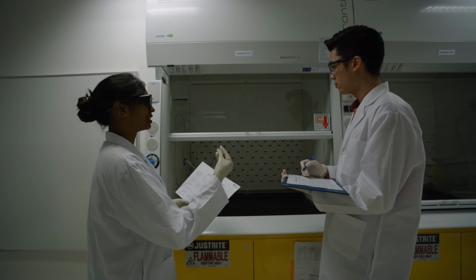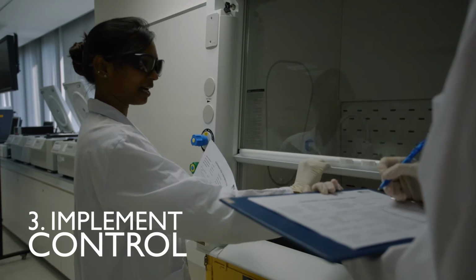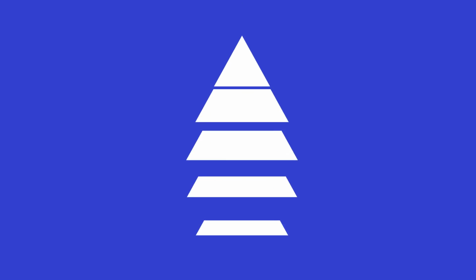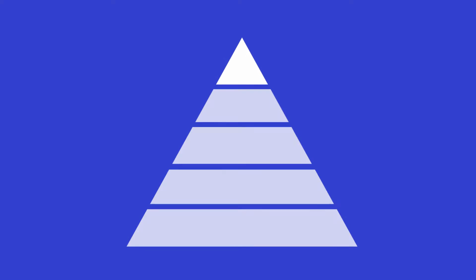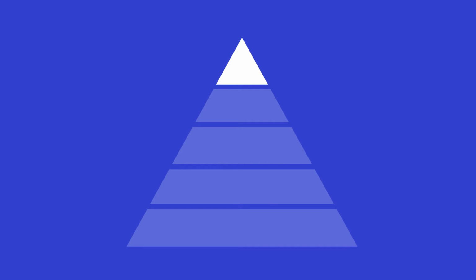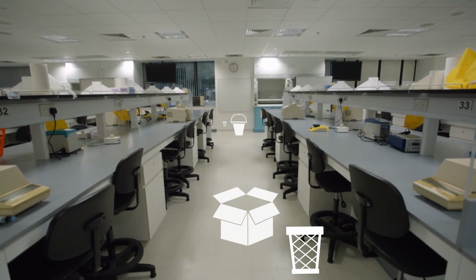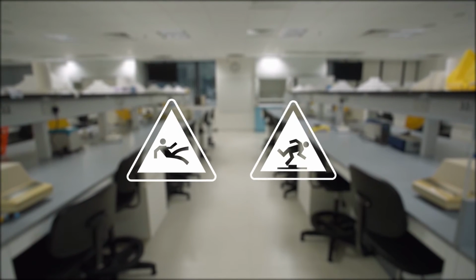Once the risk level is evaluated, the next step would be to determine additional control measures to reduce the risk level. In this step, we use the principles of the hierarchy of control to determine the reasonably practical additional risk control measures. According to the hierarchy of control, the most preferred control measure is to completely eliminate the hazard. For example, getting rid of clutter on a laboratory or workshop floor will eliminate slipping and tripping hazards.